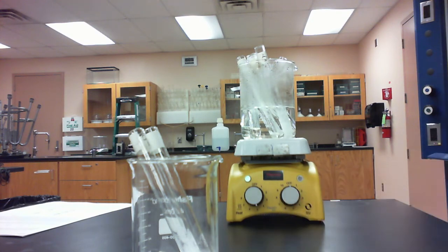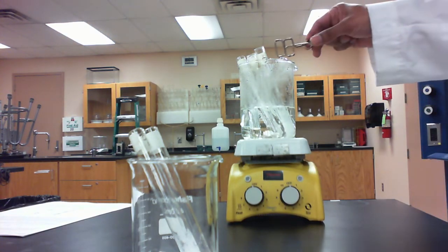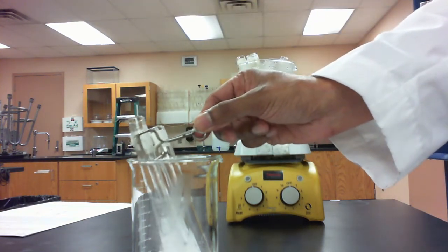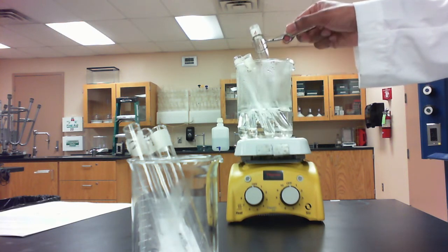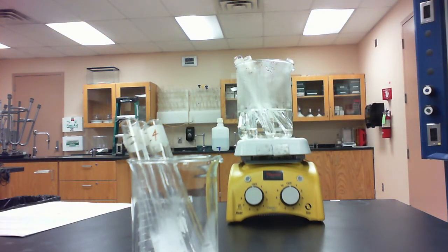So after my test tubes have been sitting in the boiling water bath for about 5 minutes, I'm going to carefully remove them using a test tube holder, and I'm going to allow them to cool down for a couple minutes before I detect the scent of, hopefully, the esters that have been produced.